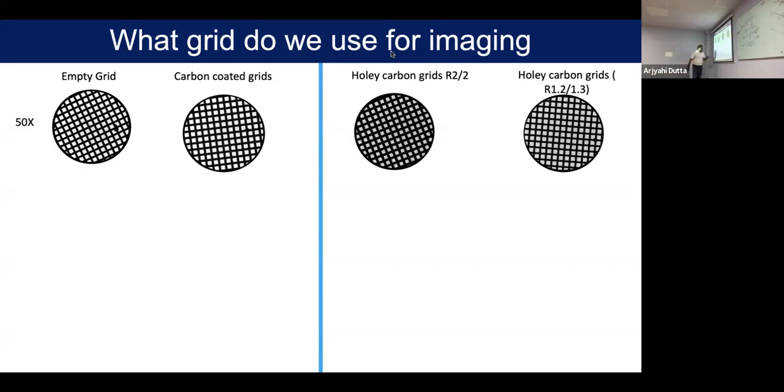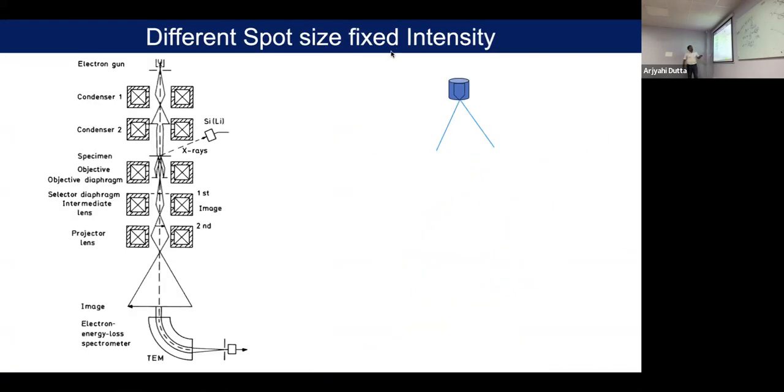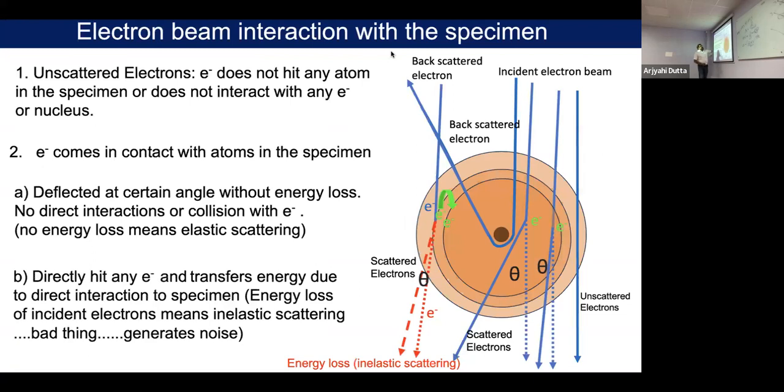Oh, one thing I forgot to talk about. Sorry. Here you can see there are some incident electrons. They are very close to the nucleus and go back, and that is called the backscattered electron. Sometimes when there is an electron, it will hit the electron and displace it, and it can go back also. Those are called secondary electrons. The secondary electron and backscattered electron we can capture, and that is called the scanning electron microscope. It is not transmitted through your atom, it is just scanning the surface. So that is the reason this electron is also very helpful.